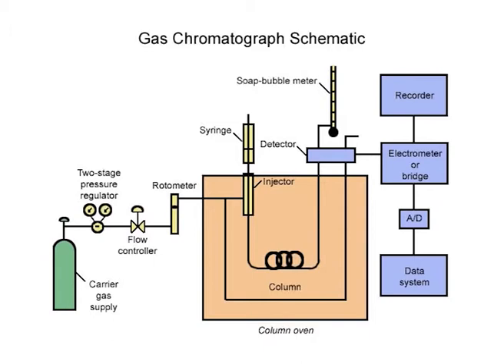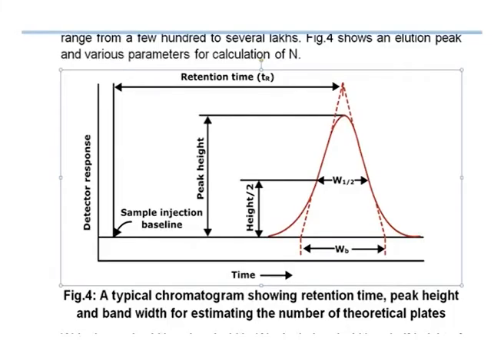Likewise, gas chromatography can be further subdivided into 3 types. It is to be noted that liquid chromatography can be carried out in column as well as planar surface, but gas chromatography and supercritical chromatography can only be performed in column. General classification of the liquid chromatography, wherein the mobile phase is a liquid. It involves liquid-liquid partition, liquid adsorbed on a solid and partition between the immiscible liquids. In case of the liquid bonded phase, the organic species is bonded to the solid surface and the partition between the liquid and the bonded surface takes place.